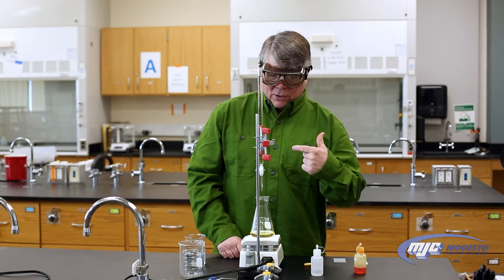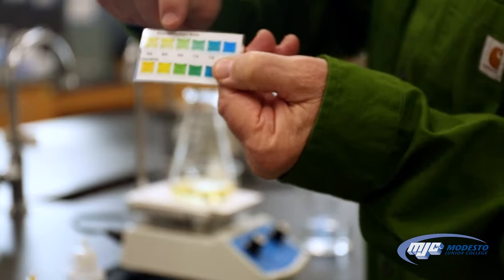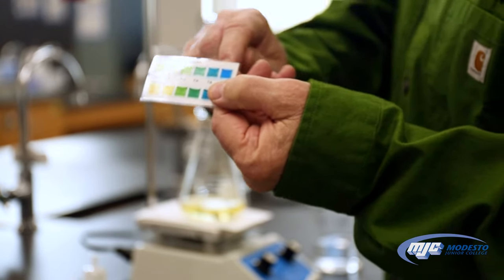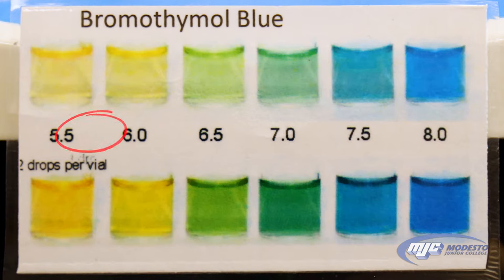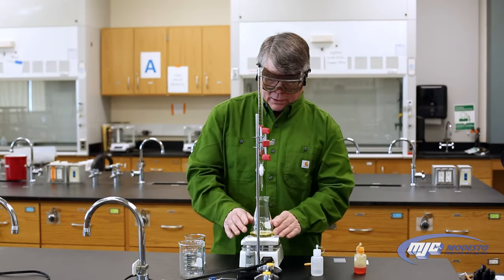What's going to happen is we're going to get a color down here — somewhere yellow or green — and what we're looking for is one quick twist of the stopcock to turn it from yellow or green to blue. Once that happens, we stop — we're at our equivalence point.